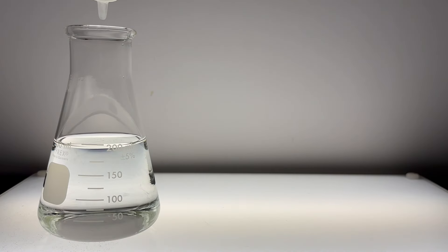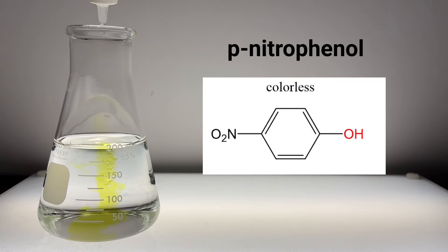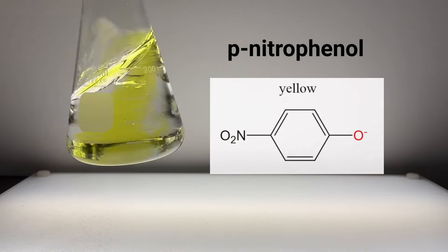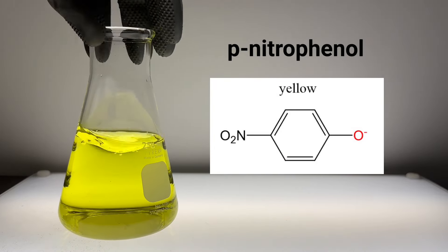The final acid-base indicator used in this experiment is paranitrophenol. This compound also becomes colored in the presence of base. In this case, it turns yellow.